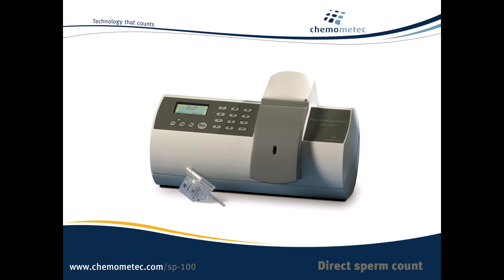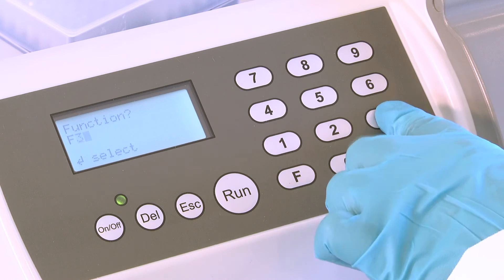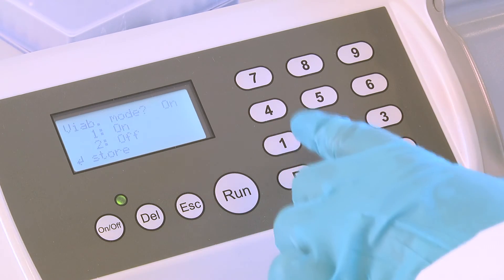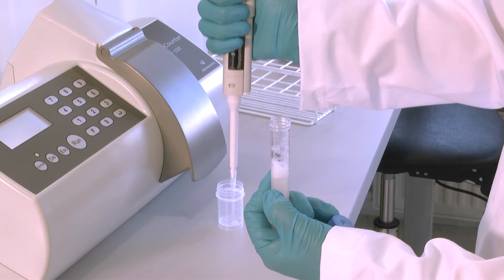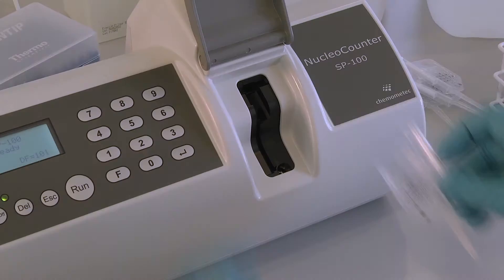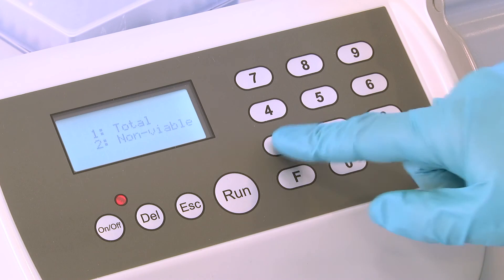When measuring viability, the Nuclear Counter must be in viability mode. Press F31. Press 1 and store the new setting by pressing ENTER. Prepare a cassette for the total cell count by diluting the semen with reagent S100 as described earlier. Insert the cassette, press RUN and press 1 to obtain the total cell count.